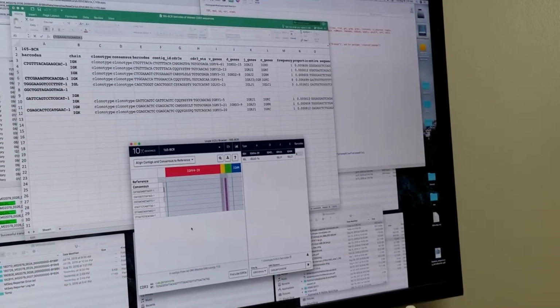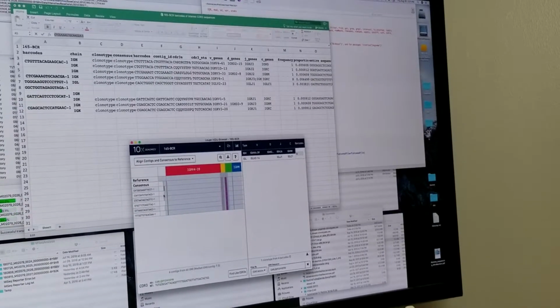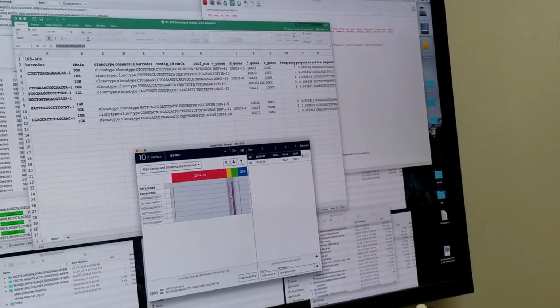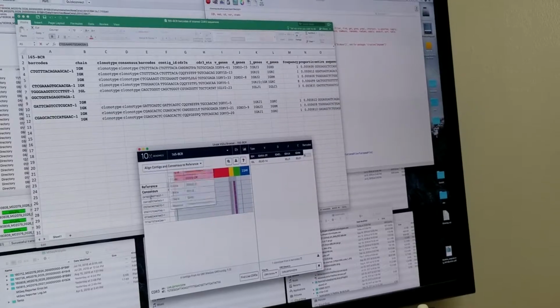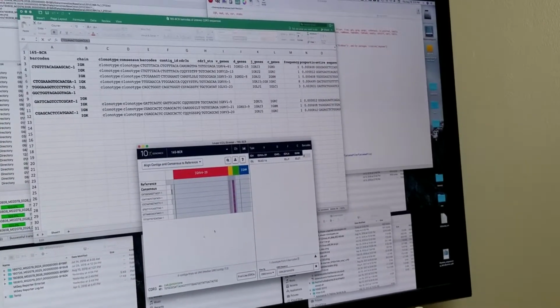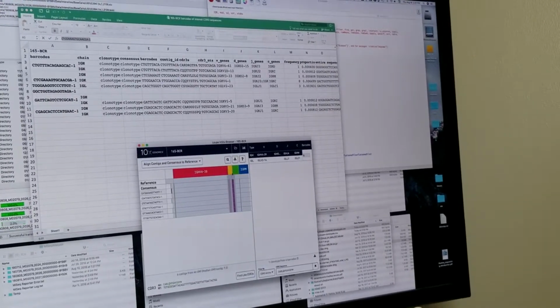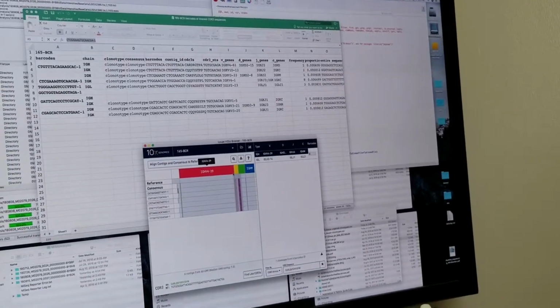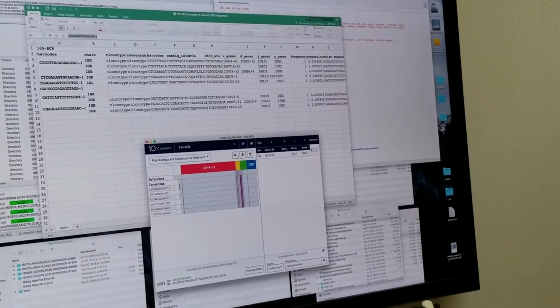And they're all the same? Yeah, they all look roughly the same. Sure, there's a couple of mismatches here that aren't in the others. They all appear to have this same deletion region. Same thing here. Now the deletions look like they're in a different spot. Yeah, the yellows are shifted over further, or the purple's shifted over further to the end of the CDR3 region, where it starts from here and goes across. It's always a deletion, though, with the P when it goes out.